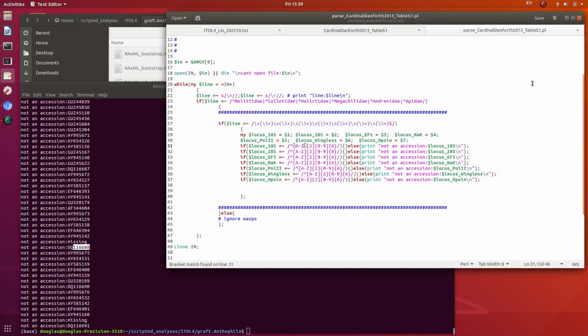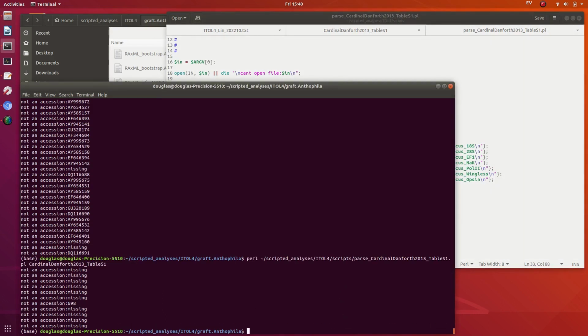Okay, I see I've used the wrong character here. So you specify a character in square brackets and you specify the number of instances of a character in curly braces. So I need to change these. Okay, twice again. Okay, so these are fine. This one looks suspicious, so I think I need to put in a line.